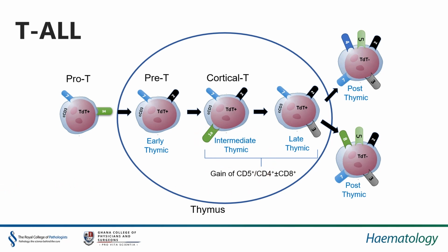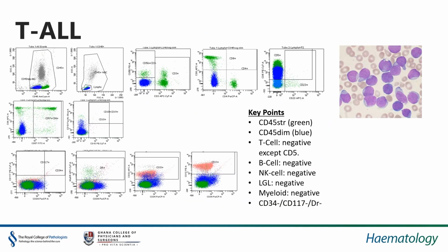So this is one of our older cases of T-ALL with a much more classical phenotype. So you can see here we've got CD45 versus side scatter in our first population. And these cells coloured in dark blue down here are our cells of interest. They're our CD45 negative or negative to dim population. And we've got our normal lymphocytes in bright green there. You can see when we plot forward scatter versus side scatter, they're all falling in that lymphoid region.